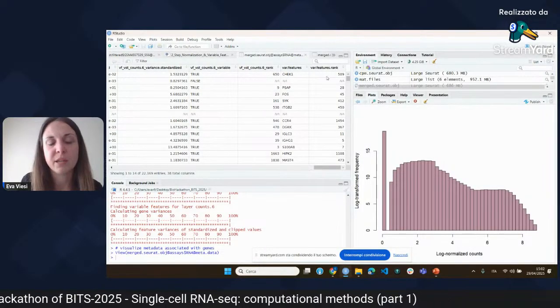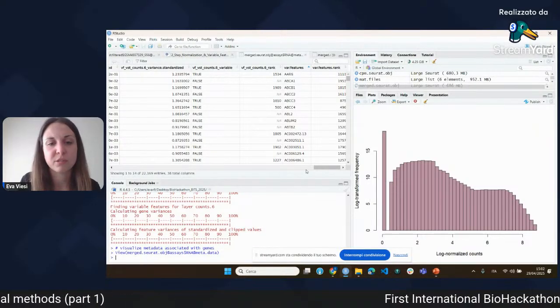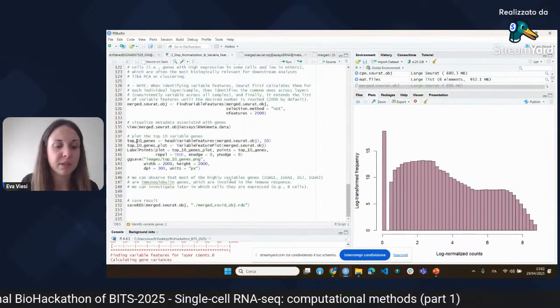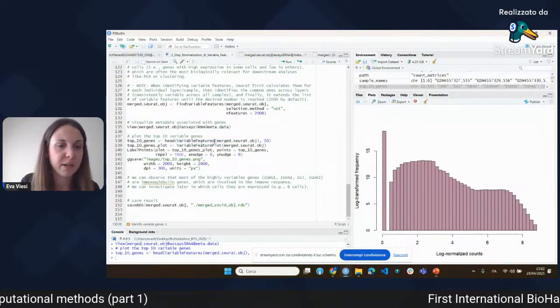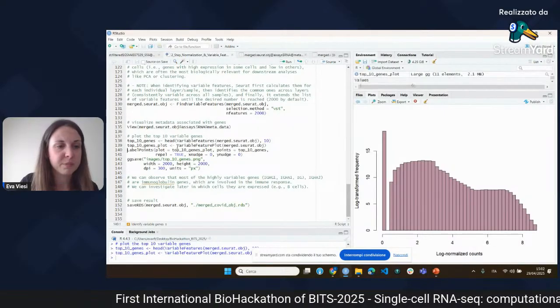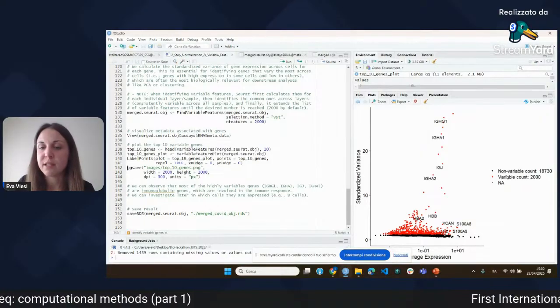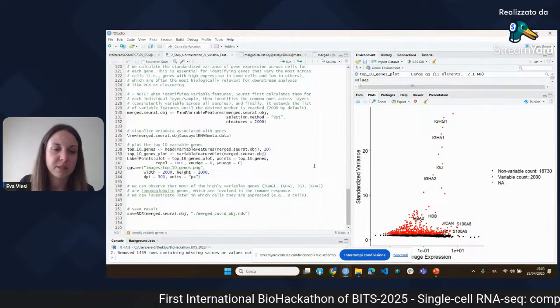At the end, we will have the ranking of the variable features identified for the single, so the individual Seurat object. We can finally plot the top 10 variable features, taking the first 10 with the variable features function, and use the VariableFeaturePlot with the labels of the names of the genes to visualize the plot of the gene average expression and the gene's standardized variance.